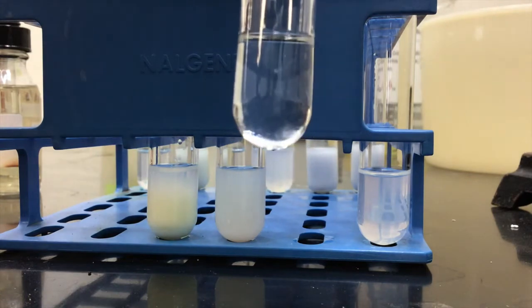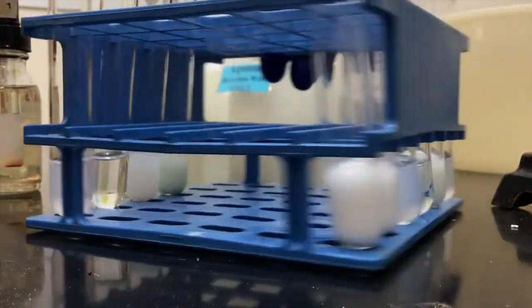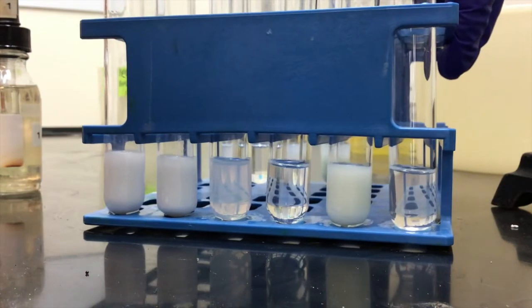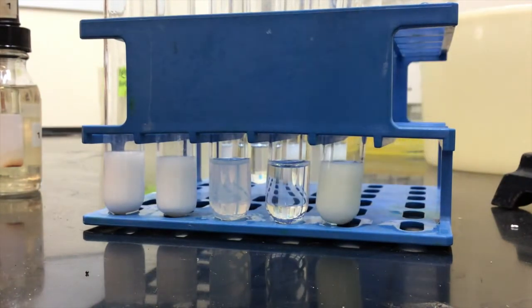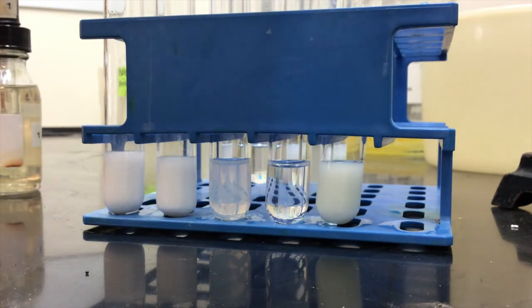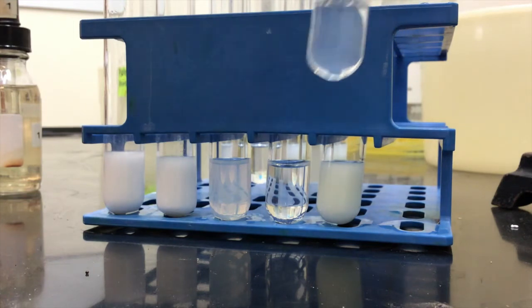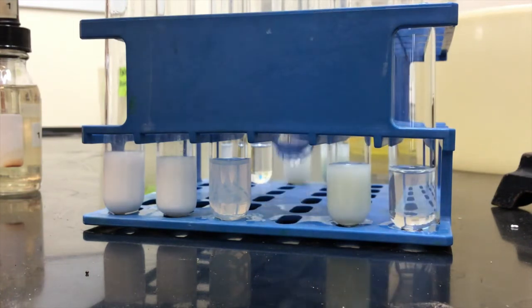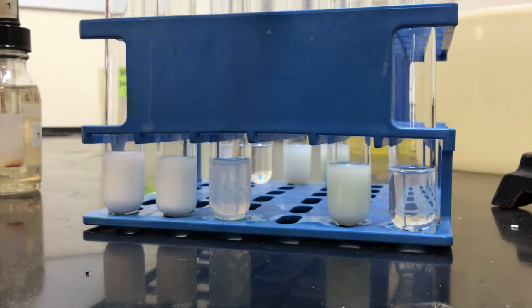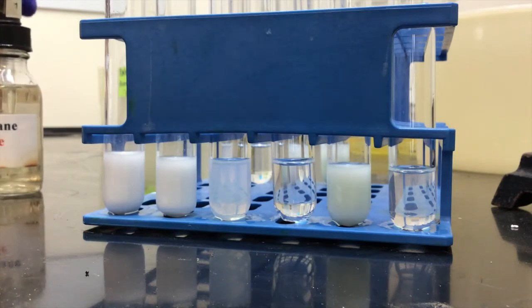Got that one right here. That's number 8. So 7, 9, and 10 are straight up killing that precipitate game. What do you think? I think they are. Number 1, I mean, he could try harder, but there's something going on there. I don't know what's going on in there. Let's see. Number 2, clearly. Number 3, let's see. Number 1 and number 3, 2-chlorobutane, and then 1-chlorobutane.